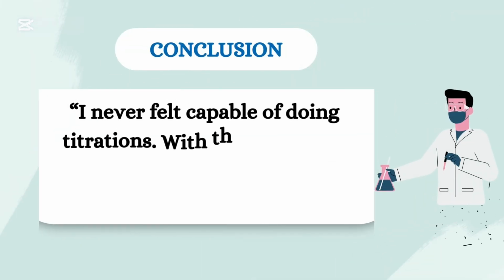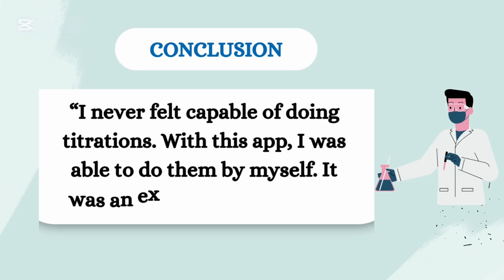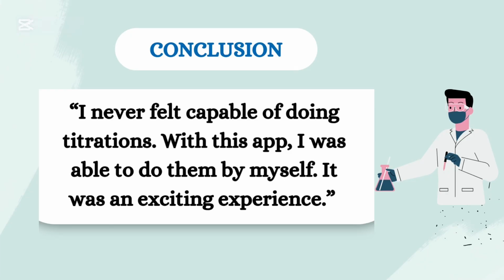In the context of analytical chemistry, where visual observation has historically been essential, the Titration ColorCam app allows us to rethink access and participation for students with visual impairments. Its use goes beyond the laboratory. It promotes a culture of inclusion in science. The results show that with proper tools, students who were traditionally excluded can perform with accuracy and safety, developing technical skills, increasing their self-esteem, and being recognized as active participants in educational processes.